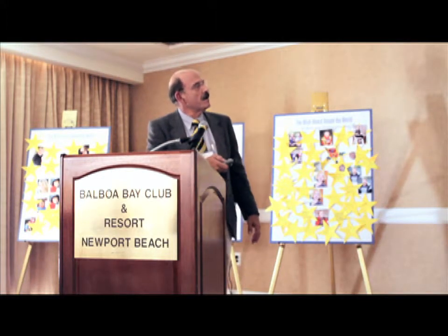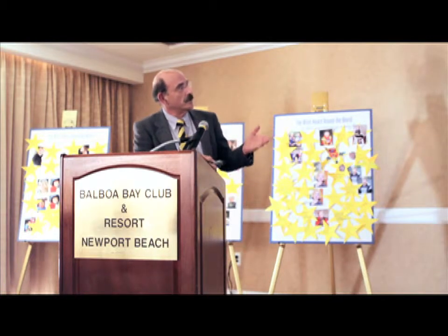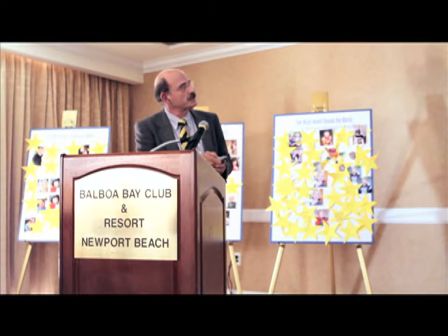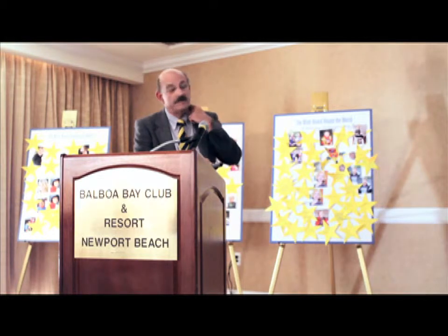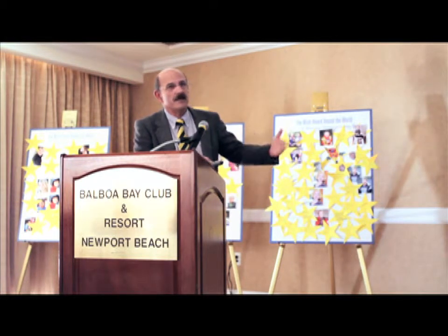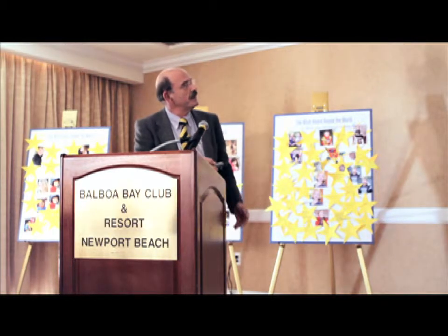So we've also gone on and tried to look at what these cells are doing. We take strips of mouse cornea, we put it onto an in vitro device where we can suspend it and then look up with a microscope and take 3-dimensional images through the cornea, as you can see there in this mount. And we use a special kind of imaging approach using multiphoton to actually collect 3-dimensional time-lapse images, and that's going to be shown here.